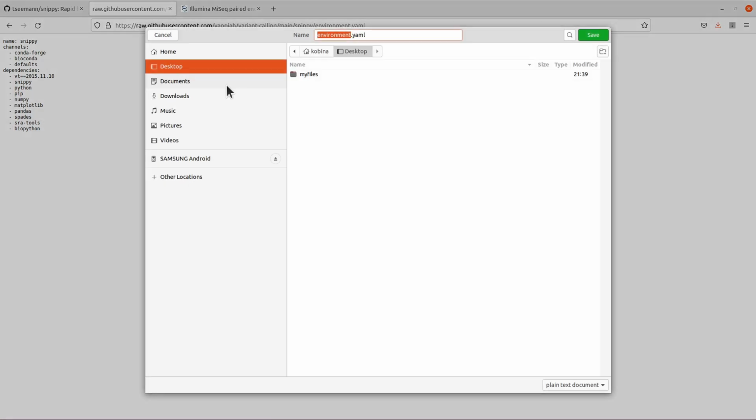I'll show you two ways of downloading. The first one is to just save it as a page. To do that, just right click anywhere and then go to save page, and then I'll just save it. I can save it anywhere on my PC. Let me just use desktop for demonstration purposes. So I have it done. That's one way of saving it.